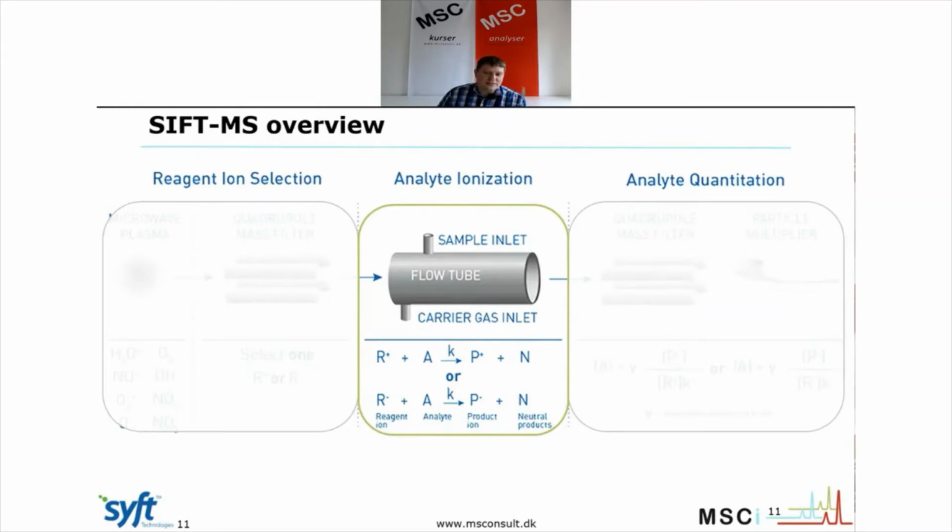But as you can see in the picture, the carrier gas inlet is before the sample inlet, and that's on purpose, because then you can take some of the ion energy out of the plasma ions before they react with the sample.